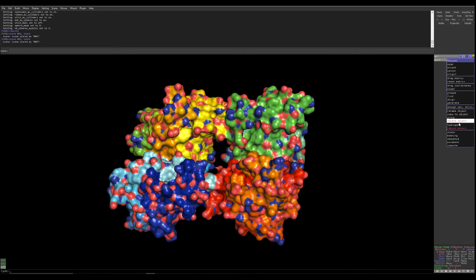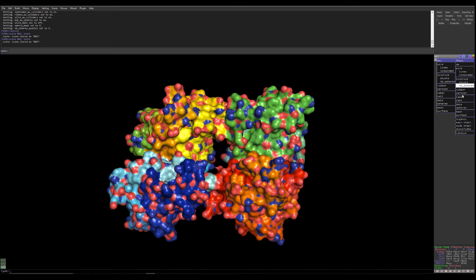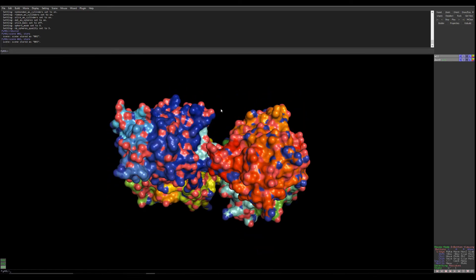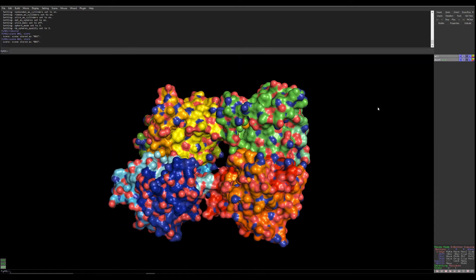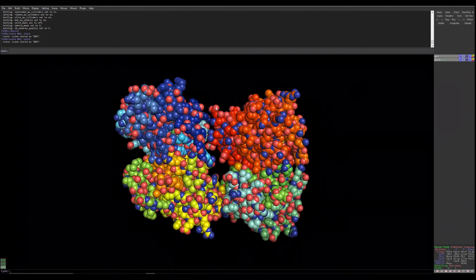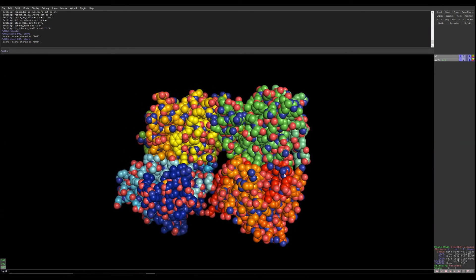Now let's make another change and show it as a sphere form. When you press S you will get the spheres, but if you are showing the surface you are not going to see the spheres. So you need to hide the surface first — go to Hide and select surface. Now you can see it's changed from surface to spheres. Let's save this as scene 004: type scene space 004 comma space store, then ENTER. Now you have four scenes.